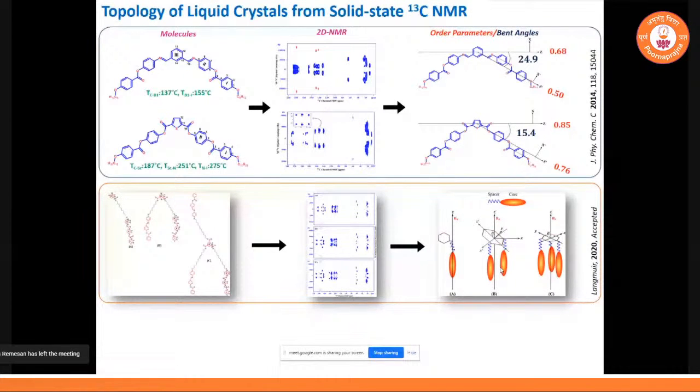You cannot spread your wings freely, because how the molecule will arrange also has to be considered: the volume of the molecule, the packing. For the final ring, it is kind of lambda shape in this planar representation. But what we proposed is a chair conformation, so it will be perpendicular to the magnetic field, where the other chains come at the bottom. This is what we proposed here.